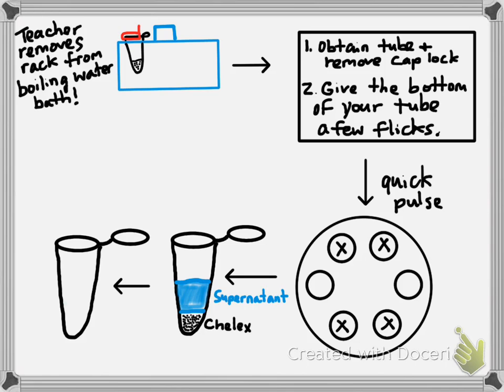So you will now transfer 60 microliters of supernatant containing your purified DNA into the new tube with your pin. Holding the Chelex tube up to the light while drawing up the supernatant will make it easier to keep the tip of the micropipette in the supernatant layer and avoid the Chelex beads. So hold the new tube up to the light and make sure you didn't transfer any beads. Place the new tube in the designated rack and store it in the refrigerator until tomorrow's PCR adventure.